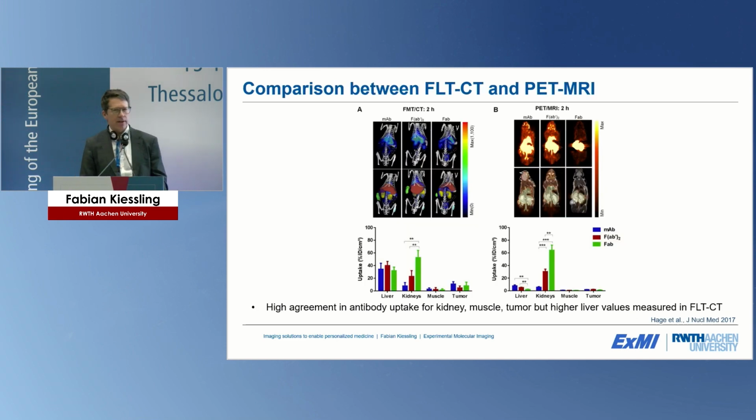The next question that we asked ourselves was, if we now compare PET MRI directly with FLT-CT, how does it compare?